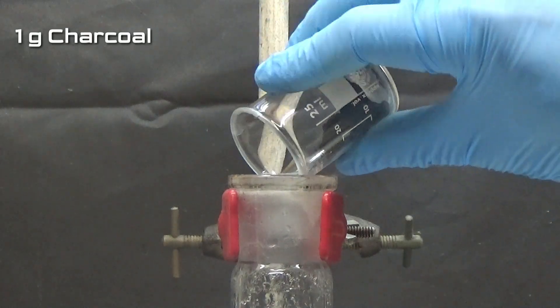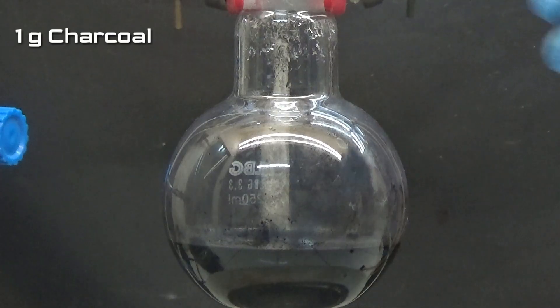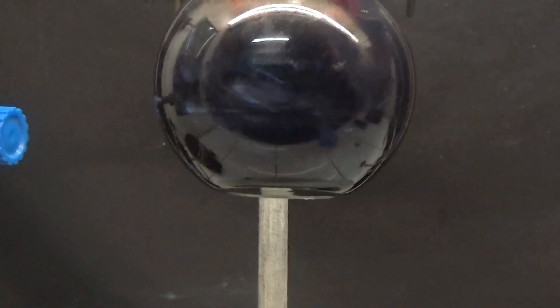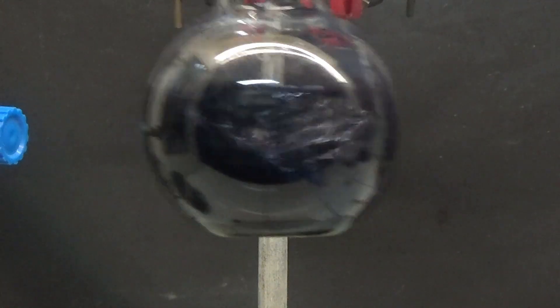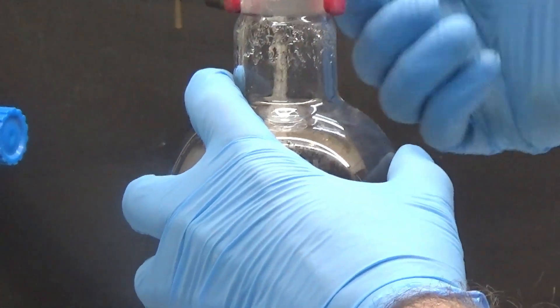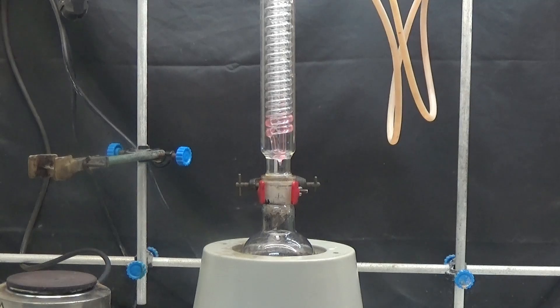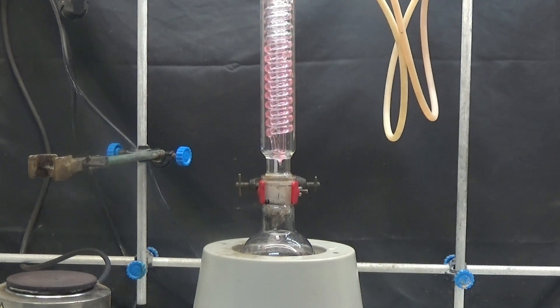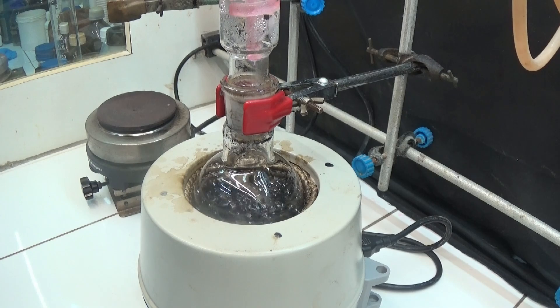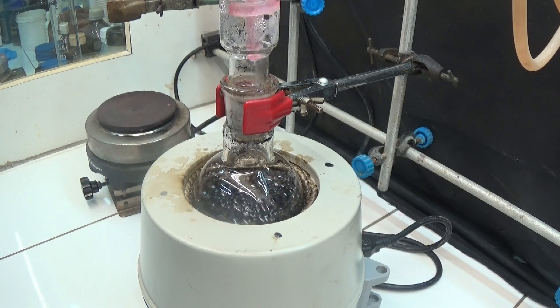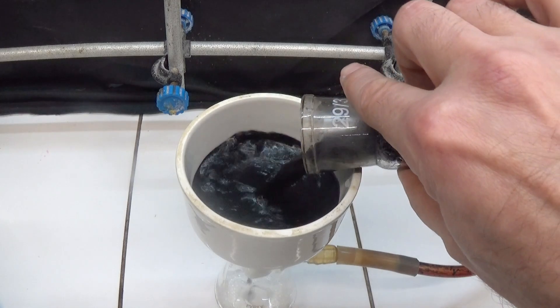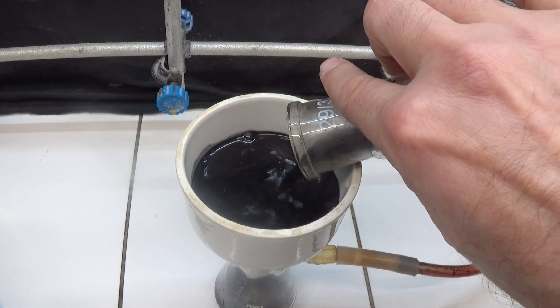To the product remaining in the flask we add 1 gram of charcoal and it is heated to reflux for 20 minutes. We filter the result through a Buchner funnel with filter paper.